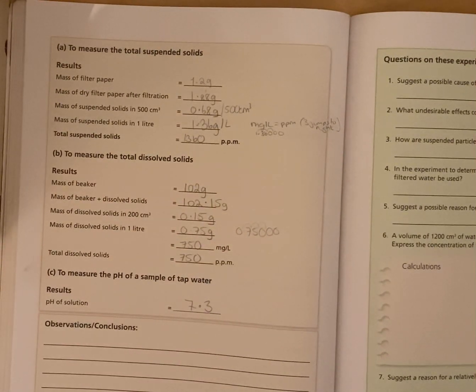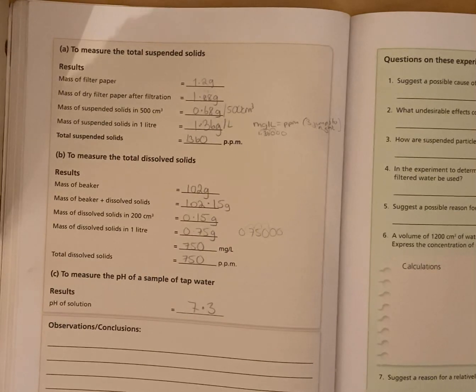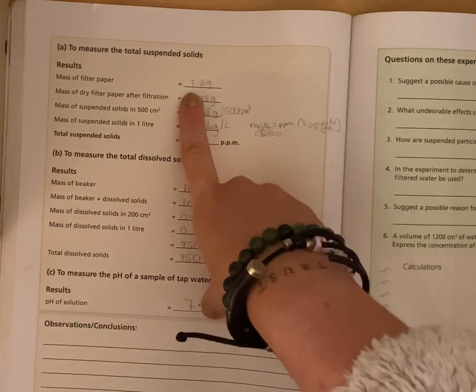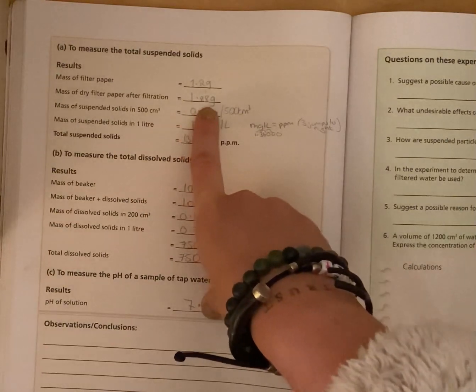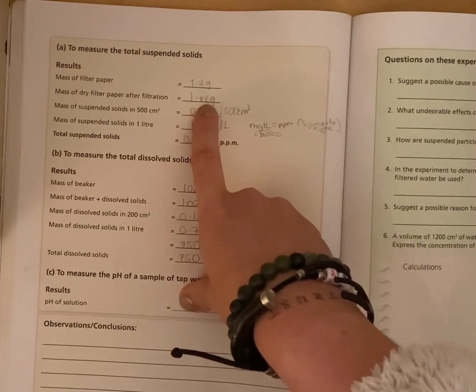The mass of the dry filter paper after filtration. So once you put the liquid through it, it's now collected some solids along the way. We've let it dry out so that the water, the pure water, evaporates off of the filter paper. And we can see we're left with a higher number. So my one has gone from 1.2 grams and it's gone up to 1.88 grams. So there's an amount of suspended solids on the actual paper now.